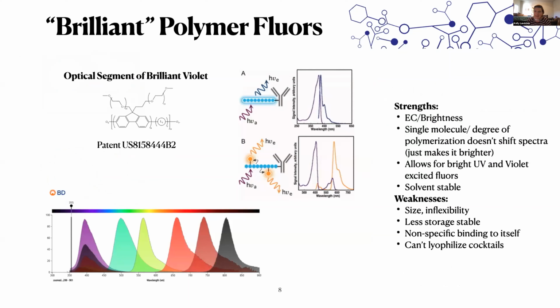I've always been surprised that the brilliant polymeric fluors didn't take off in microscopy more than they did. I think they're still wide open for them to really enable multicolor microscopy. This is actually my baby. This is what I did at BioLegend for 11 years.